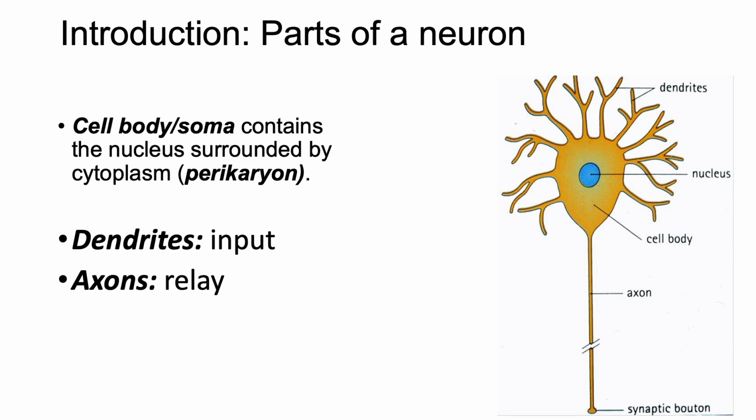So the neuron or nerve cell is made up of this spherical body you see here. It is the cell body or soma. It contains the nucleus, colored blue here, which is usually dark or black. In this case, it's colored blue. And then the cytoplasm, within which the nucleus is situated. So the cytoplasm is within, and then the nucleus lies inside the cytoplasm.